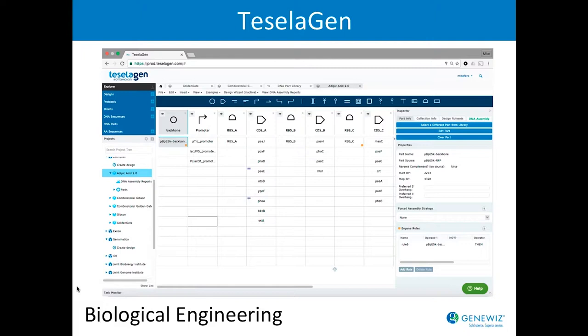So it looks a little bit like EDA software, but more like a whiteboard that a molecular biologist might use to sketch out a piece of DNA, not only 5' to 3', but also combinatorially. So you could have many choices of, say, a promoter or a ribosome binding site or a coding sequence. And then a lot of the stuff that goes around that are things you need to source your DNA, to talk to the automation systems, for security, for checking against business rules and biological rules, all kinds of things like that.